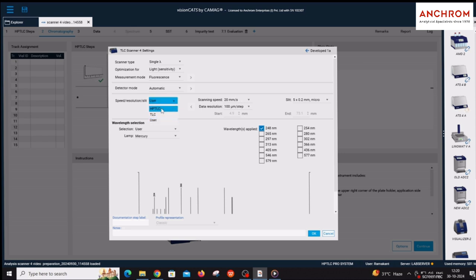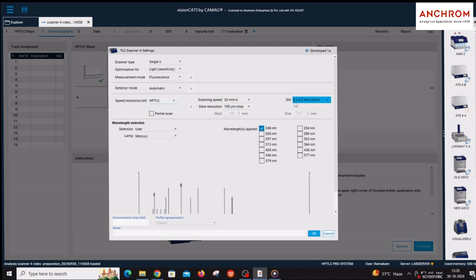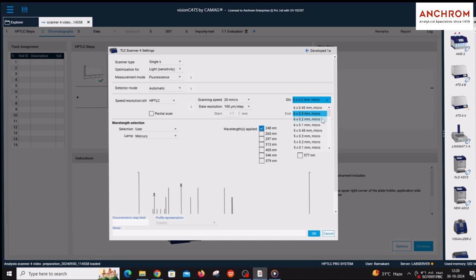Scanning speed and data resolution should be kept as 20mm per second and 100 micrometer per step respectively. Slit is by default selected to 5 x 0.2mm micro. If application length is changed from 8mm, select the slit as 60 to 80% of the application length.